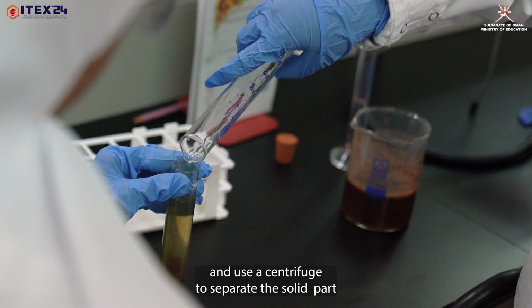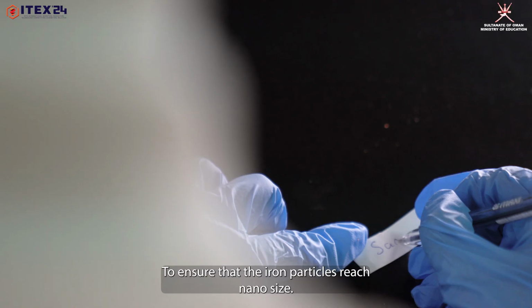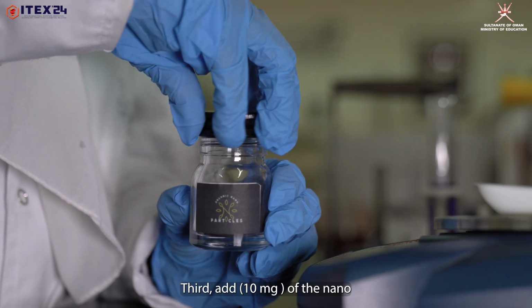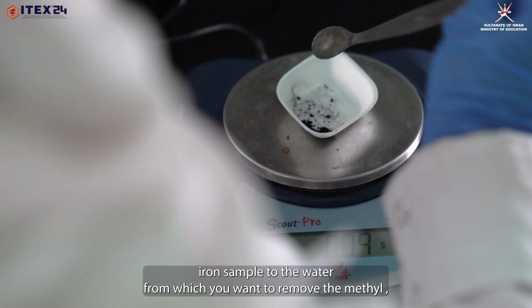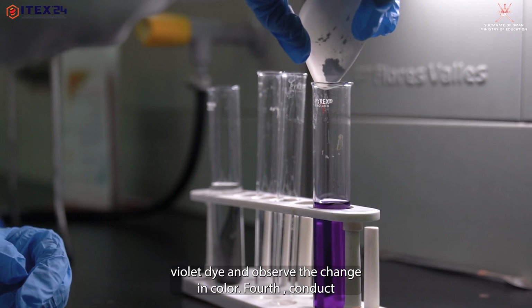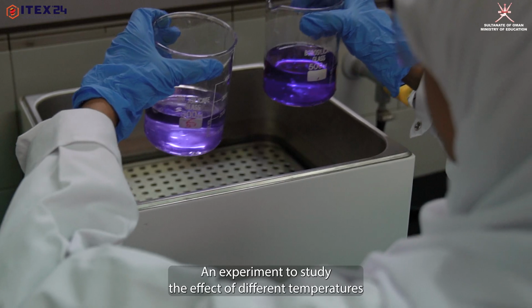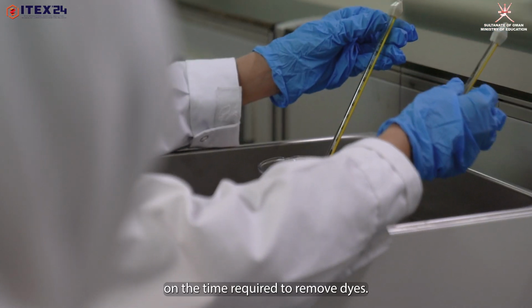to separate the solid part, and send the sample to Nizwa University to ensure that the iron particles reach nano size. Third, add 10 mg of the nano-iron sample to the water from which you want to remove the methyl violet dye and observe the change in color. Fourth, conduct an experiment to study the effect of different temperatures on the time required to remove dyes.